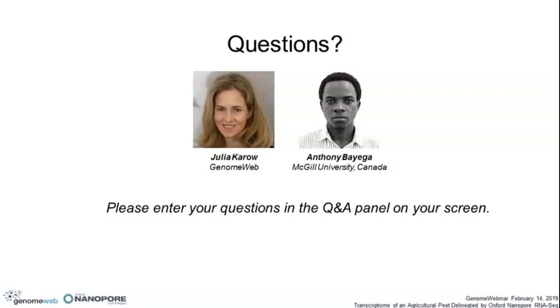Yes. So there are about two questions there. So how do we calculate the error rates? We just align the reads onto the genome, and we wrote our own tools to identify the alignment identity. But there are so many tools. There's AlignQC that gives you the alignment rates and the errors in your reads. It does a lot of such descriptives. If you want to do that, you can use AlignQC. You align your reads, supply it with the BAM files and the reference, and then it will calculate for you all the error rates, quite detailed.